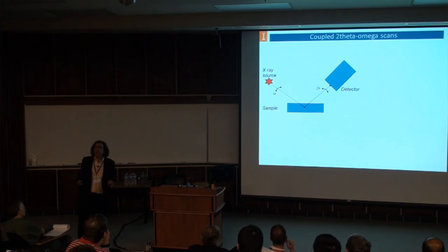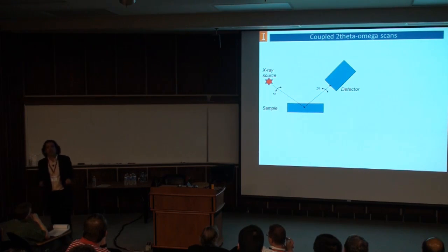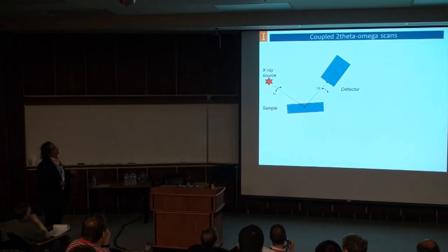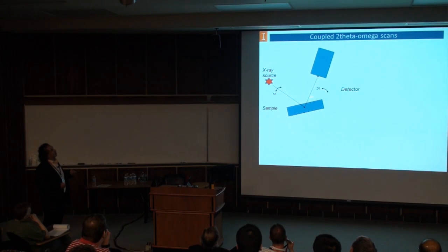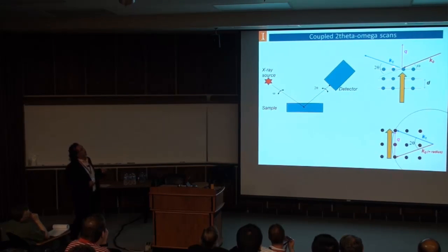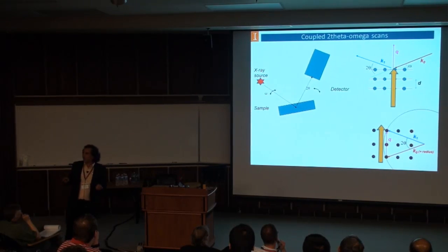All right. The most basic type of measurement in X-ray diffraction is called a 2 theta theta scan, 2 theta omega scan, omega 2 theta scan, theta theta scan. There are many ways people talk about that. But if you want to learn one type of measurement, that's the one you should learn. So what happens here? During this measurement, the angle of incidence and the detector angle change together. You do that either by rotating the sample or the tube and moving the detector. So when you do that, let's go now to our picture: direct space, reciprocal space. Now, this is very important for the end of the talk.